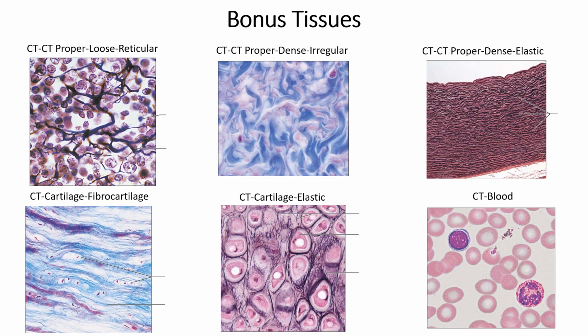In a somewhat regular pattern, but notice how these fibers look a little bit more stretchy, right? They look like they have more elasticity, more stretch and recoil to them than what we saw with the regular dense connective tissue.